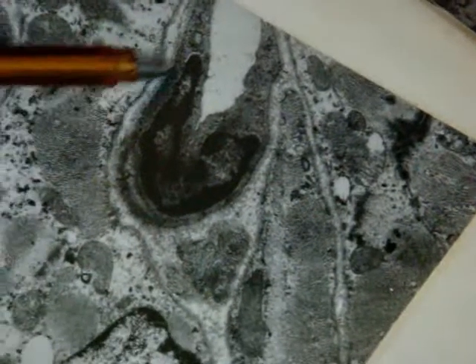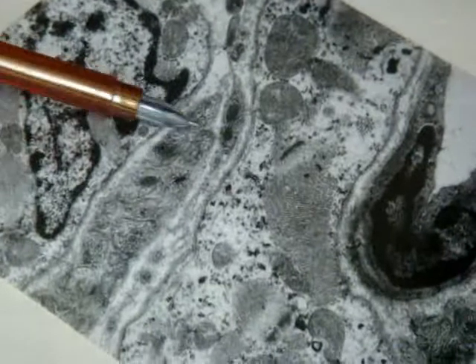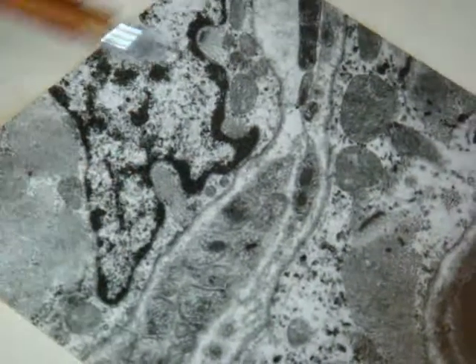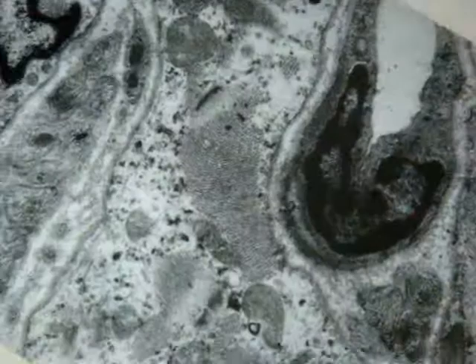What is it? Between adjacent cardiomyocytes, we can see a blood vessel. Blood vessel with lumen. And look at this. What is this structure and this structure? Between cardiomyocytes, we can see again an unmyelinated nerve fiber. Axon inside, axon inside of Schwann cell. And this very thin cell without basement membrane, fibroblast.